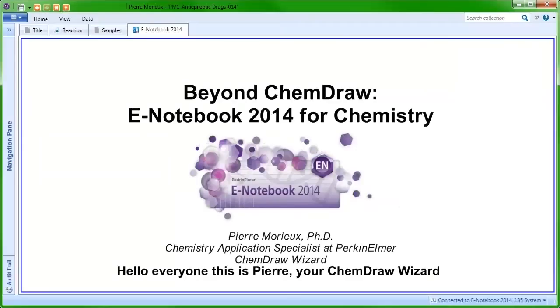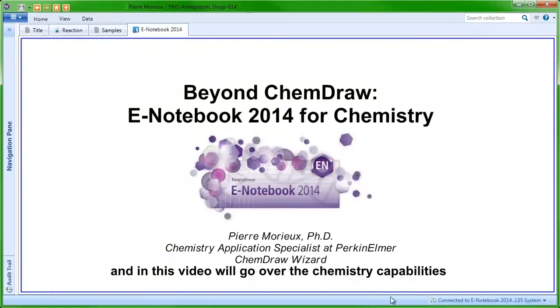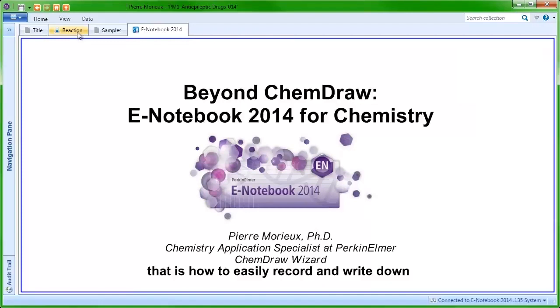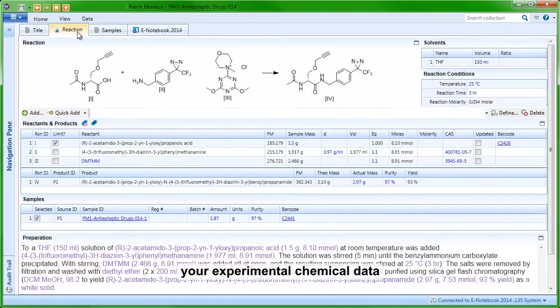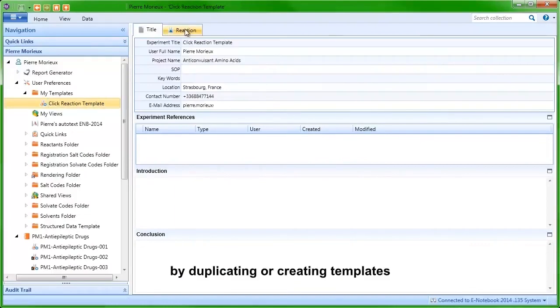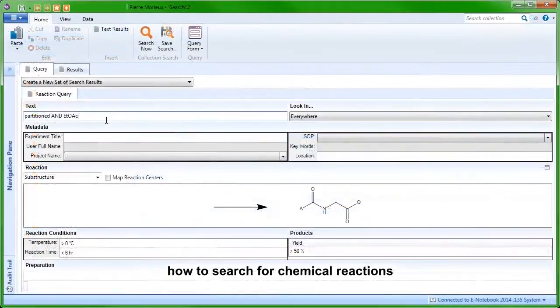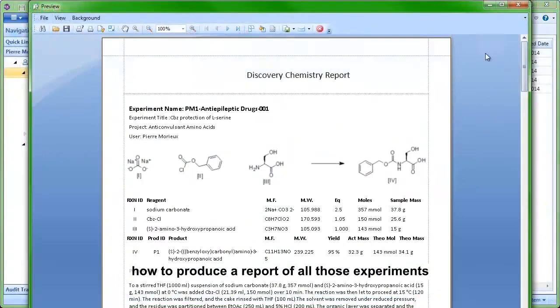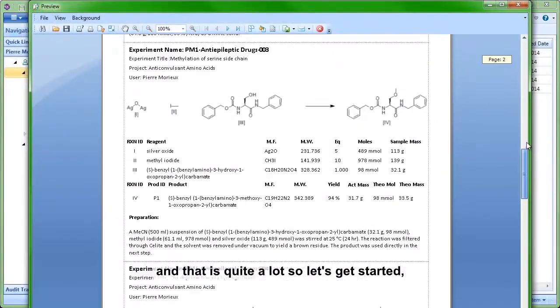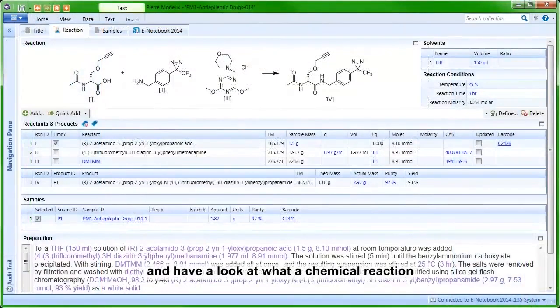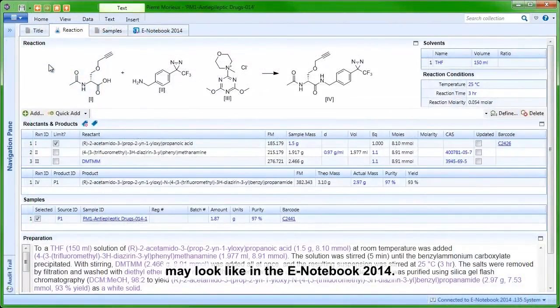Hello everyone, this is Pierre, your ChemDraw Wizard. In this video we will go over the chemistry capabilities of the E-Notebook 2014: how to easily record and write down your experimental chemical data, how to reuse already existing information by duplicating or creating templates, how to search for chemical reactions, and how to produce a report of all those experiments. So let's get started and have a look at what a chemical reaction may look like in the E-Notebook 2014.